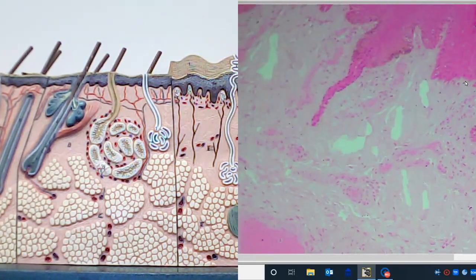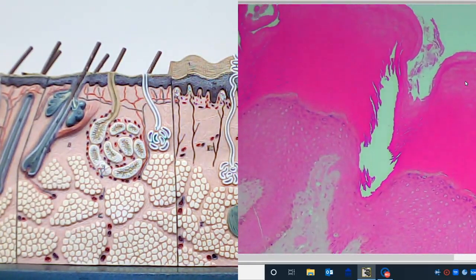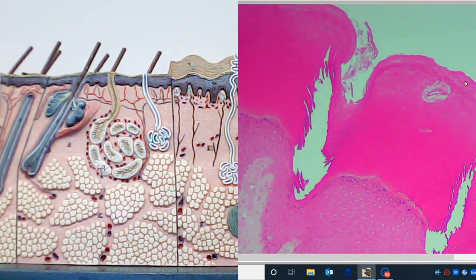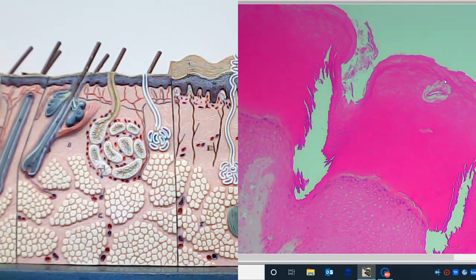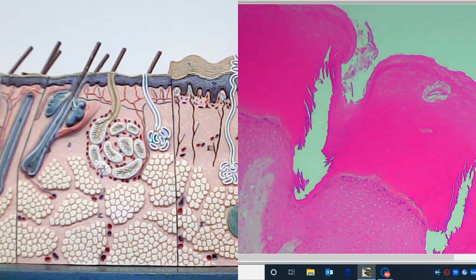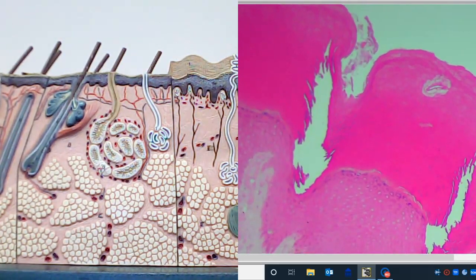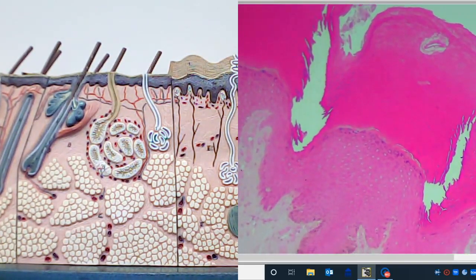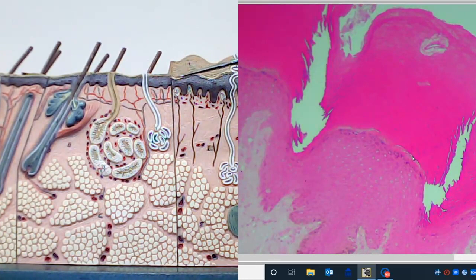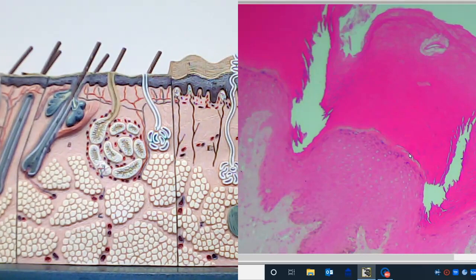At the 10x objective, we can see the very deep part of the duct structure and then, at the apical surface, we have the pore in the stratum corneum. The stratum corneum is dead cells that have been filled with keratin, and that keratin is going to offer protective properties to the skin.